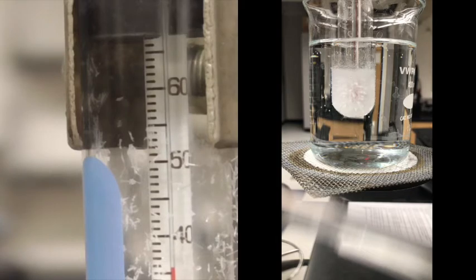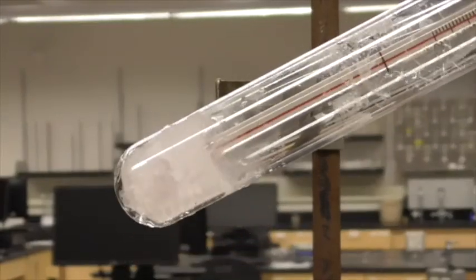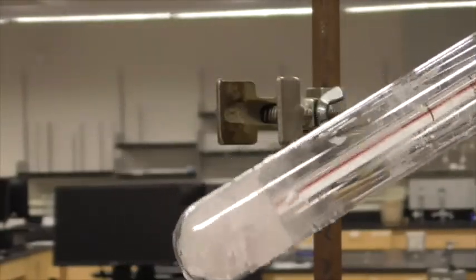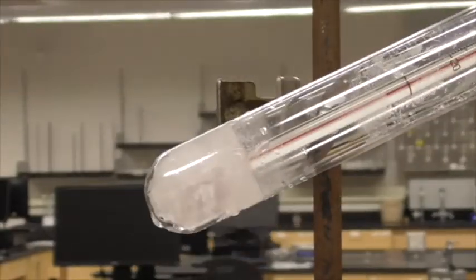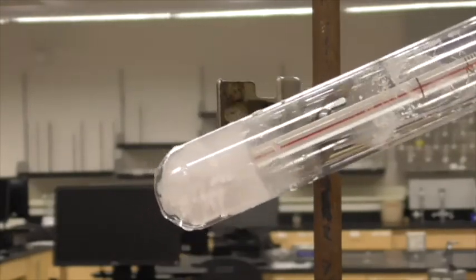So it looks like 20 minutes was probably enough because it definitely went through the plateau and is now cooling again. So we're going to stop it here. So we're going to take our sample and put it back in the hot water because the thermometer is definitely stuck in there right now. So we're going to melt it and then get the thermometer out and put it away.